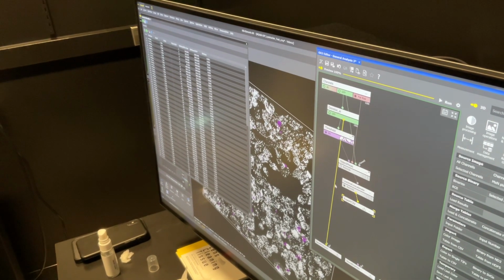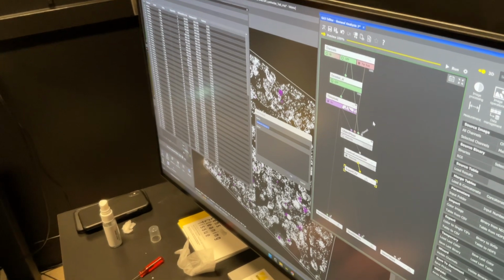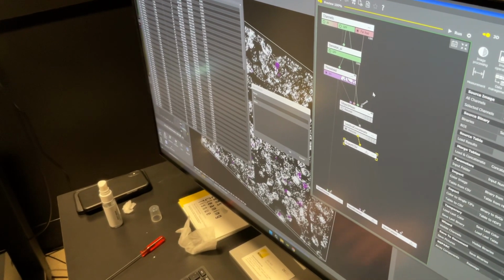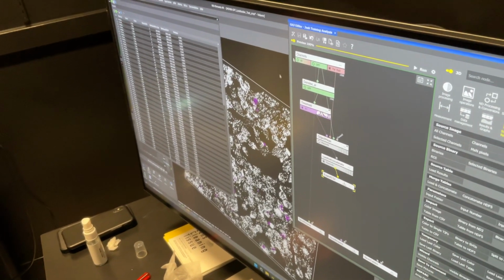Now let's say I want to run this exact thing on another image. So we'd save this. We're going to call this, what do you want to call this? We can just call it analysis one. Josh, put your name in there. JP1, yeah.